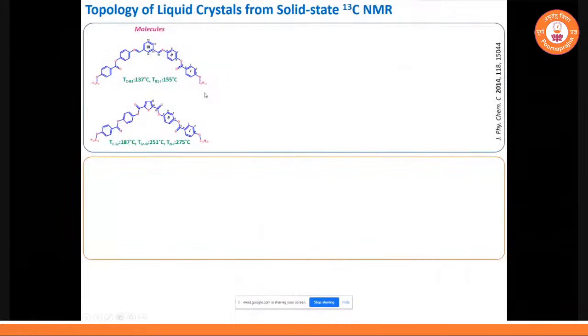As I already told, in my research work I use dipolar coupling. Let's say for example, here a carbon is attached with a proton. I try to measure this CH interaction, and not only that one but all the carbons which have an interaction with the protons.